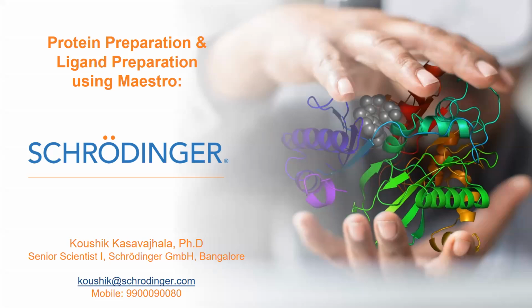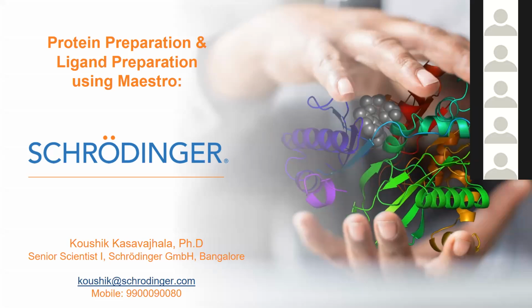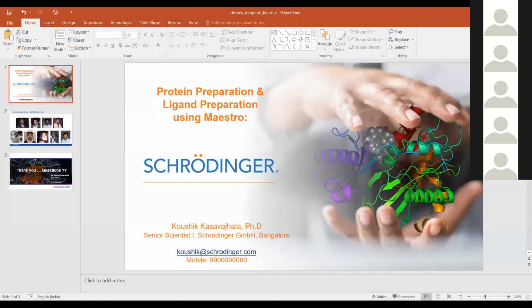Thanks, Shelvia. A very good morning to all of you. Today, the demo session will be on protein preparation and ligand preparation using Maestro. I have my email ID here. If you have any questions, you can always reach out to me after the end of the talk, if your questions are not answered at the end of the talk. And the mobile number is also displayed here. You can always reach out to my mobile number as well. So I'll not be doing any presentation here. I'll mostly be doing the demo session using Maestro. And so let's just get started and proceed with the session.